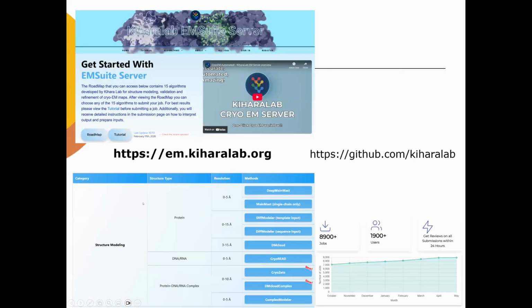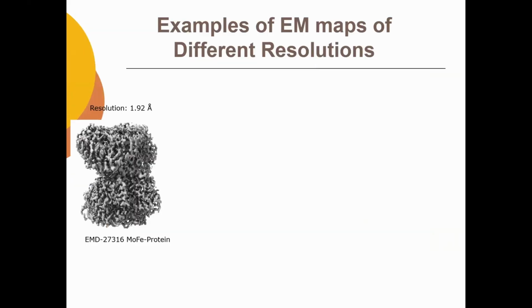Okay, so this is about the server. Now, as you know, the structure information you can get from cryo-EM data really depends on the global resolution.